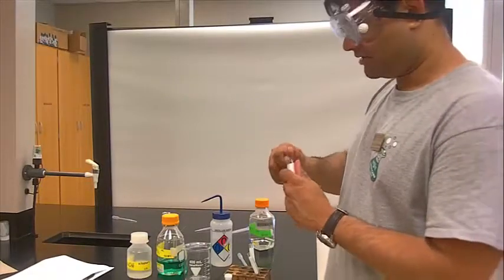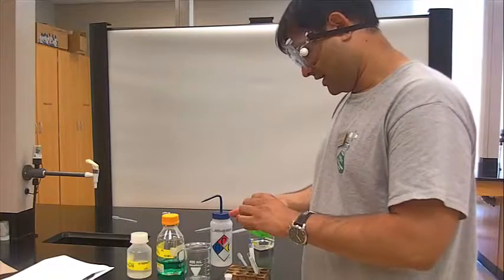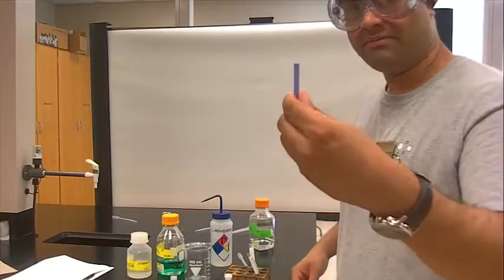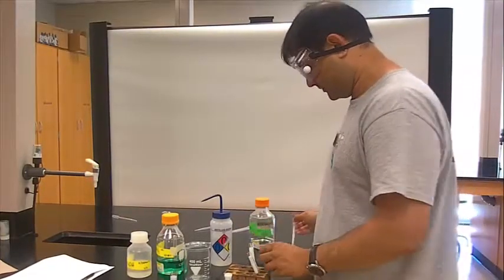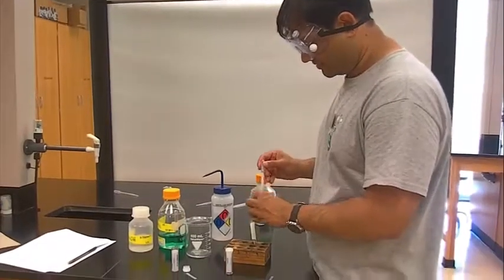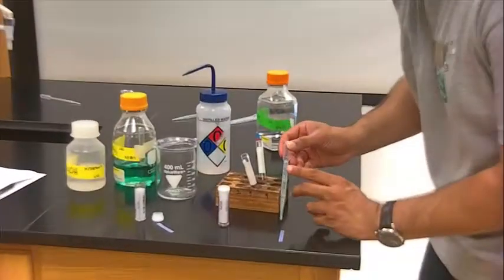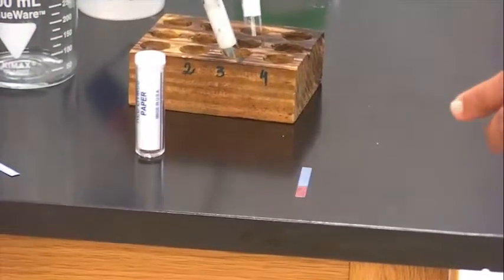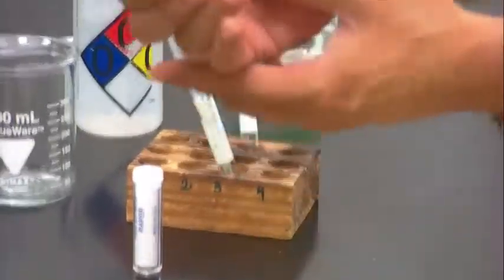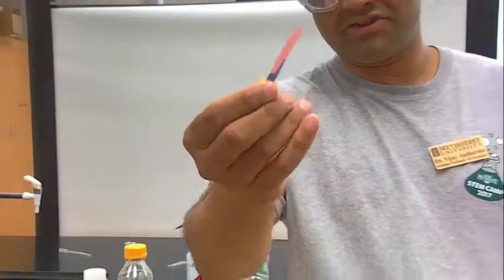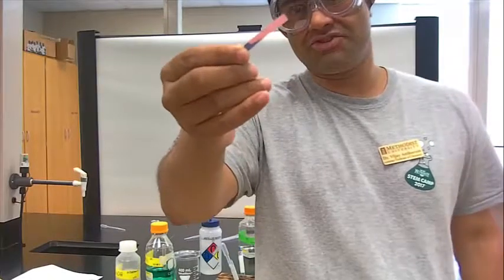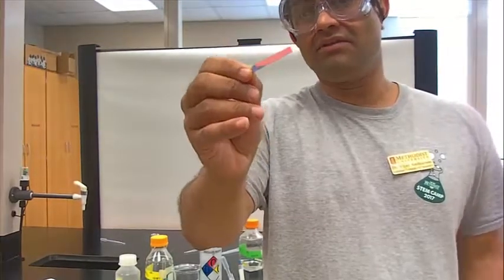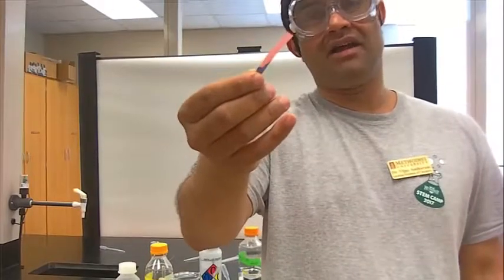To do that experiment, you're going to take your litmus paper, either blue or red. This litmus paper is just a strip of basically pH paper. Get a piece of litmus paper out and just add one drop. You don't need to swap it. Just add one drop. You notice that when I added that one drop, that blue litmus paper has turned to red or kind of a pinkish red. That means that it is acidic. If you see a blue color, think basic. If you see a pink color, think acidic.